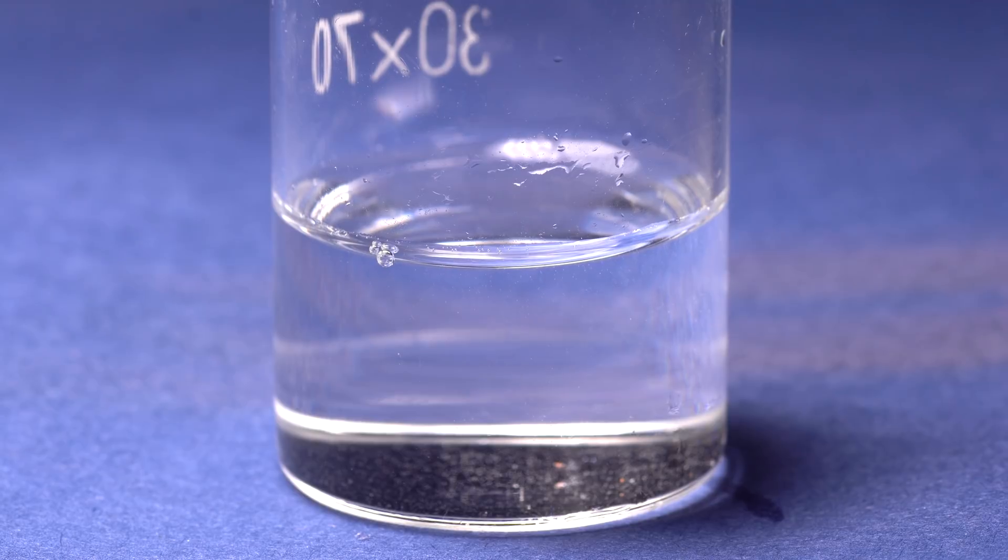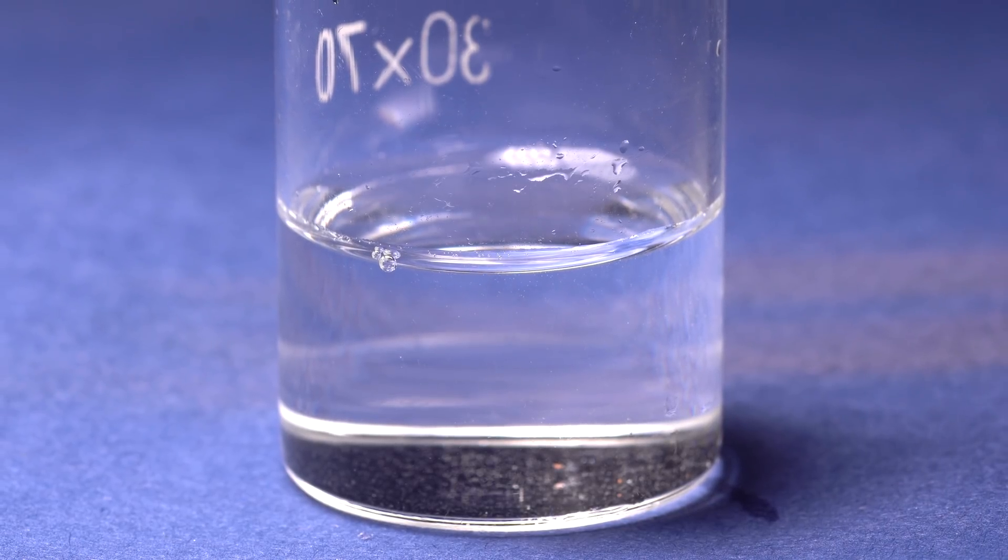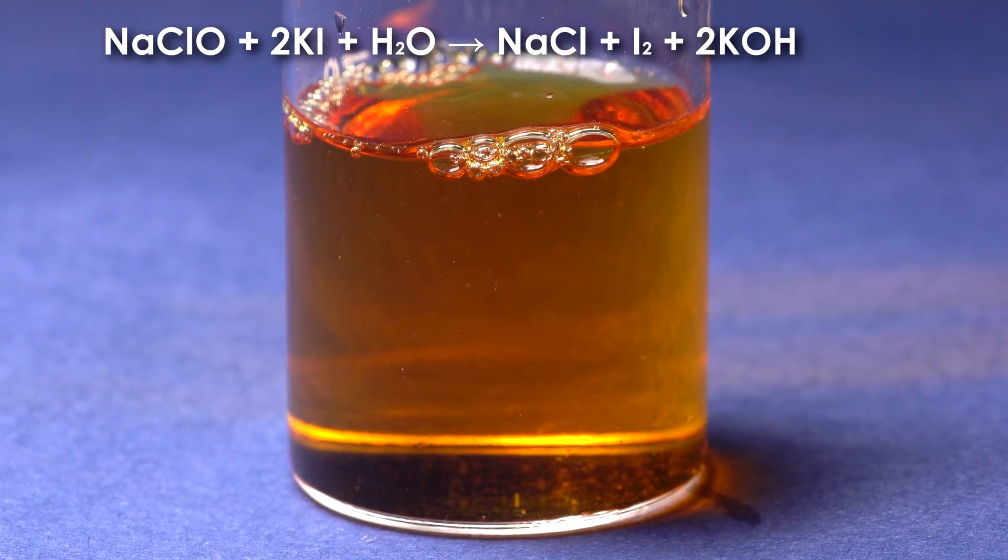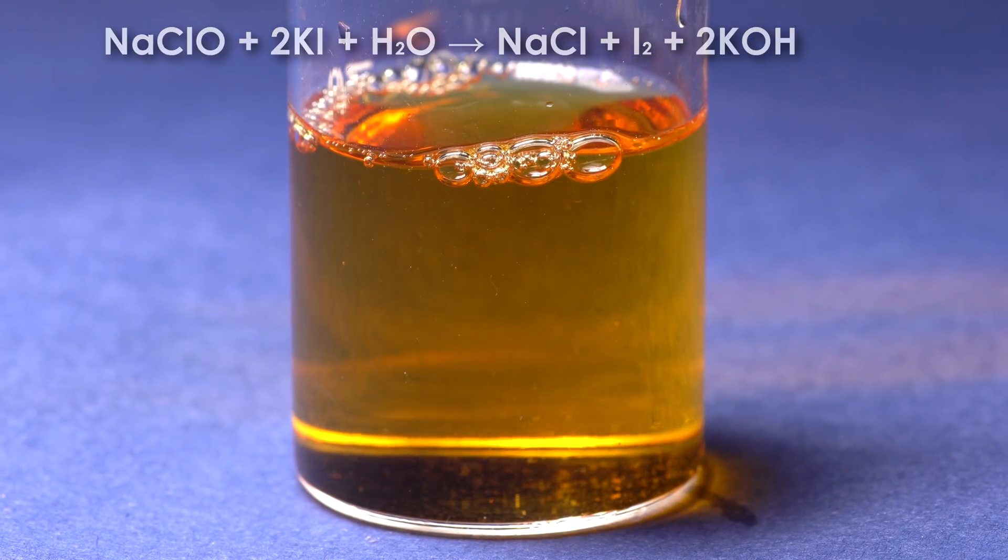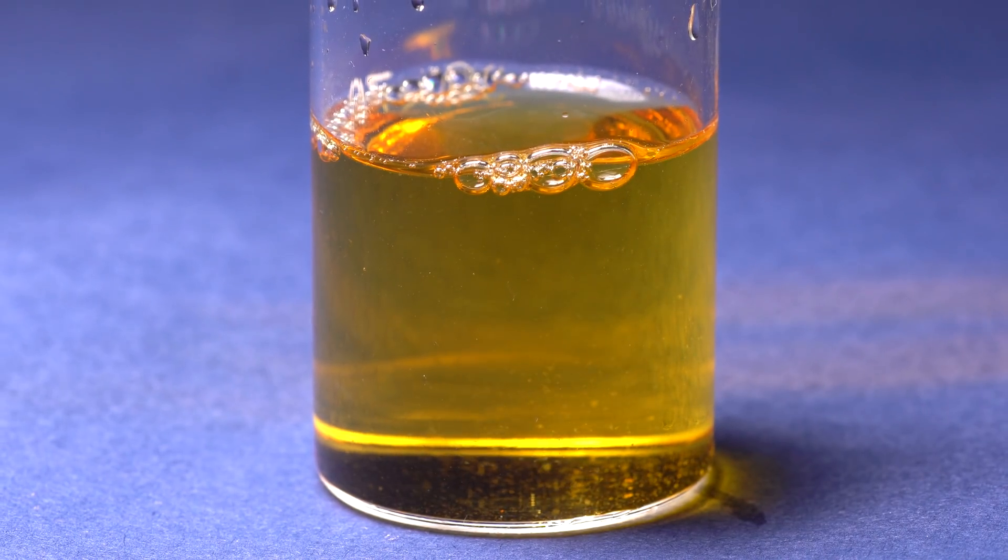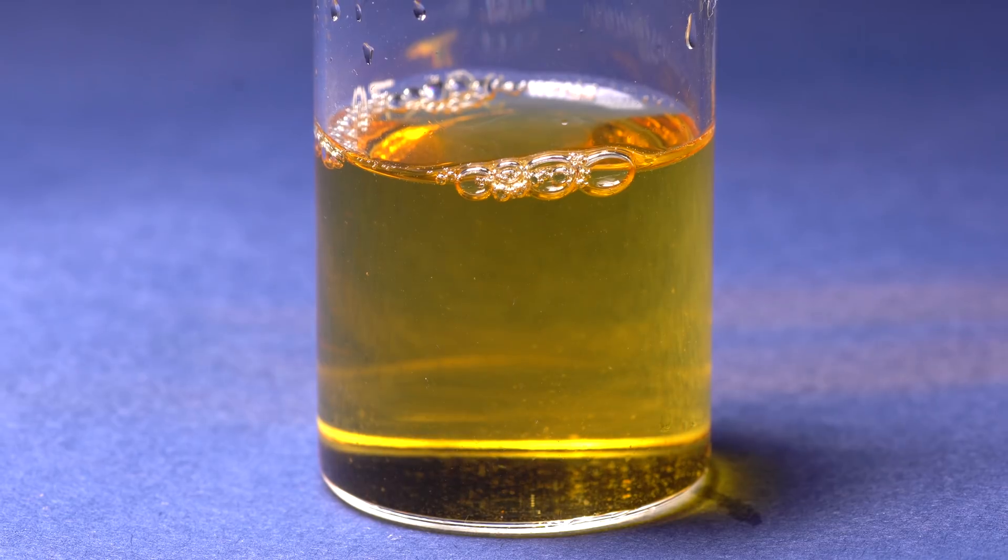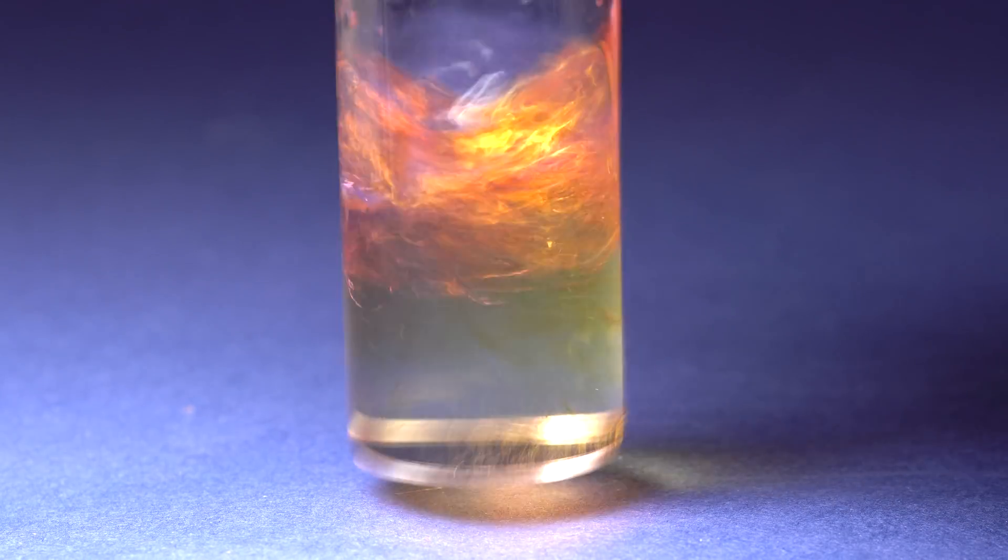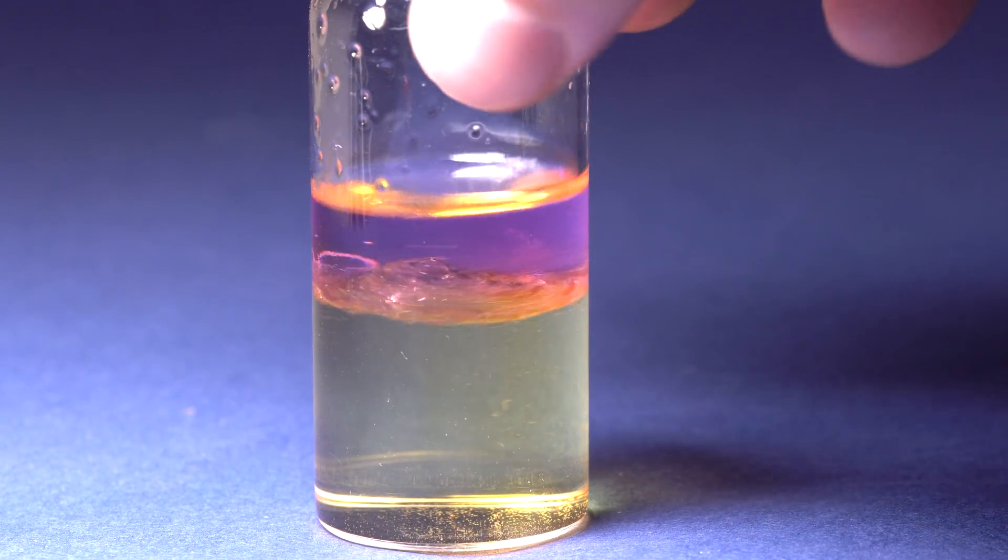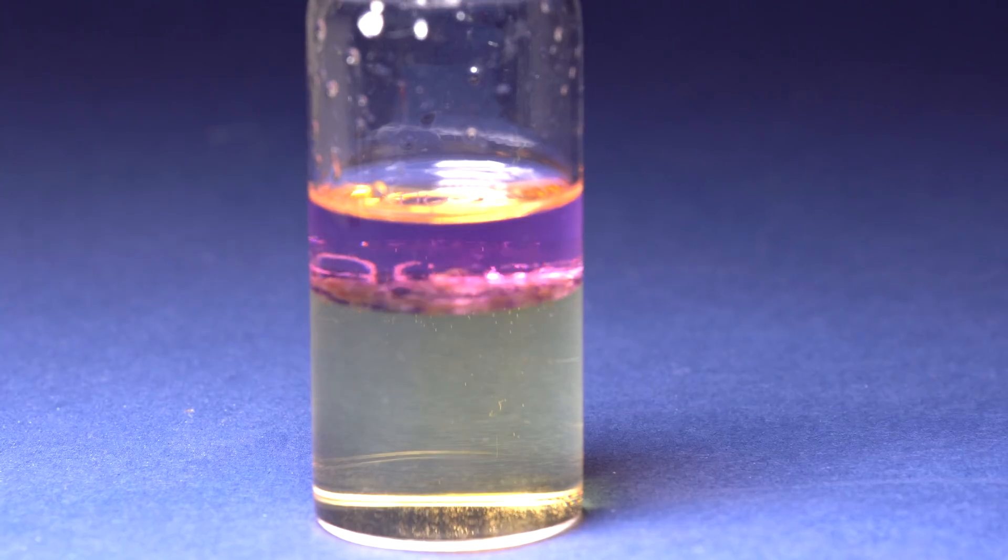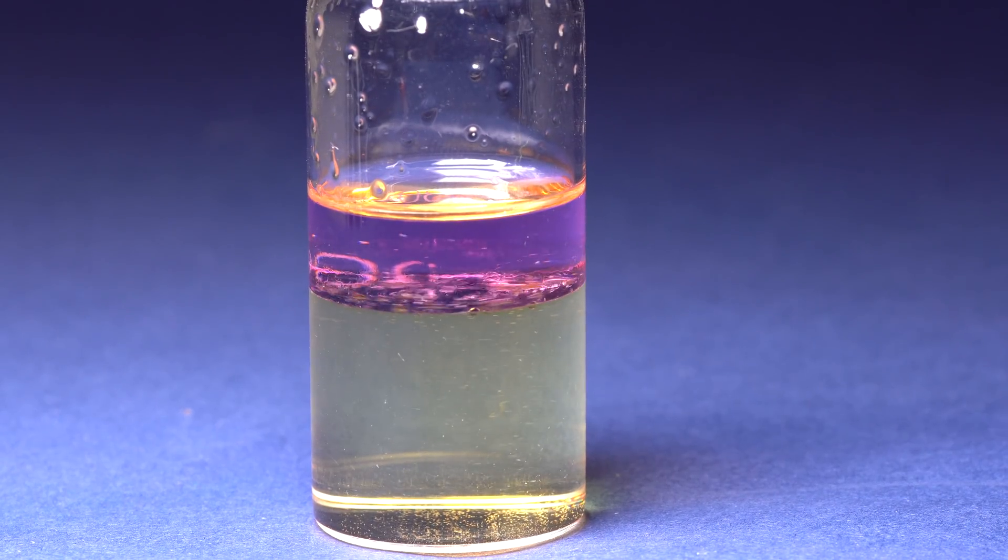Besides, chlorine can oxidize another halogen, iodine. This can be proven by pouring a bit of chlorine bleach into the potassium iodide solution, as the bleach contains a bit of dissolved chlorine in water. As a result of this reaction, free iodine is formed, coloring the solution into a dark color. To better see the iodine, I have added a bit of toluene into the test tube, in which iodine dissolves better and has a purple color.